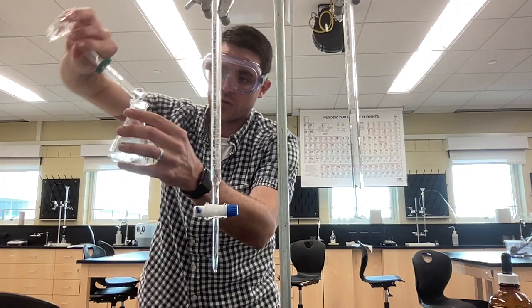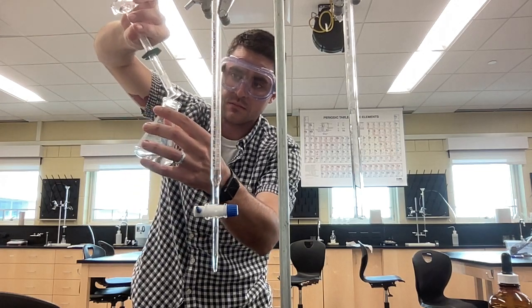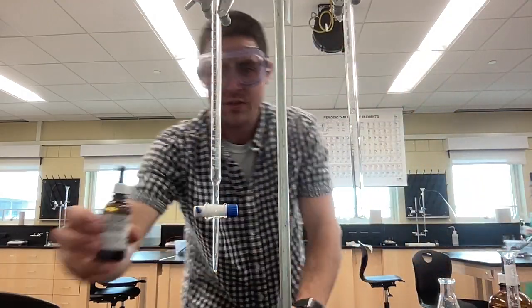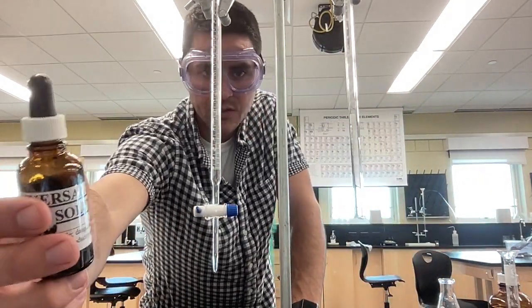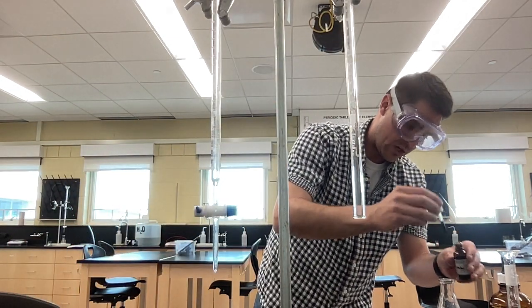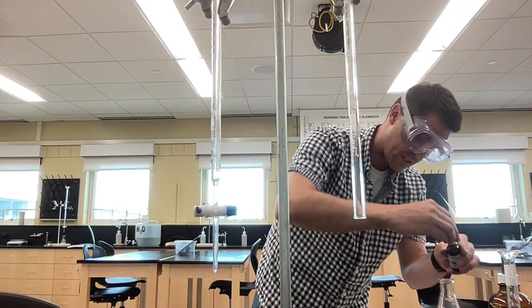I'm going to add it to the Erlenmeyer flask here. Get all the drops out, get it down the side. And I'm going to add my indicator. We know that sometimes it's hard to see the reaction. So I have a universal indicator. And we learned last time that the universal indicator will turn red or yellow in the presence of an acid.